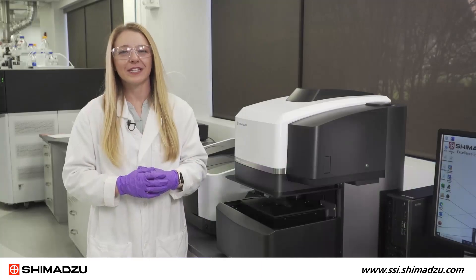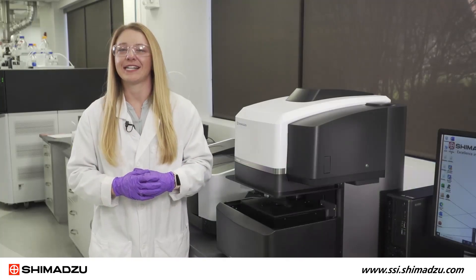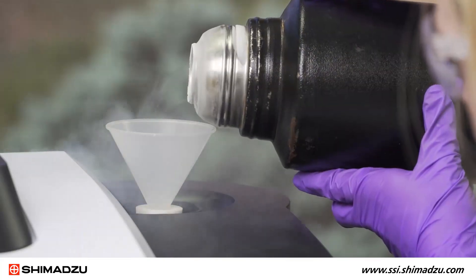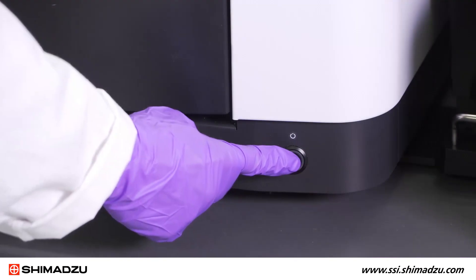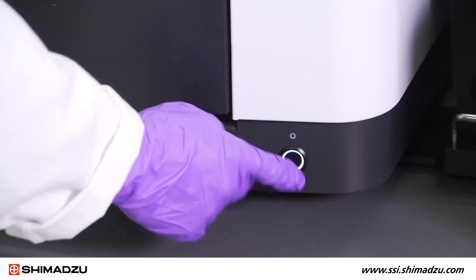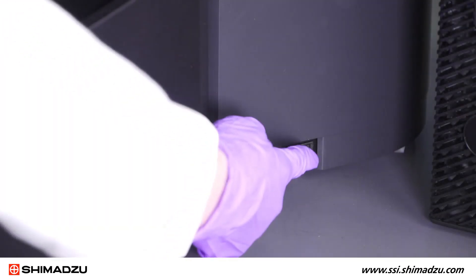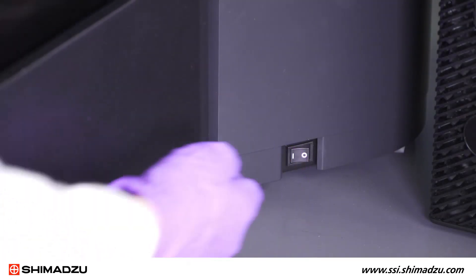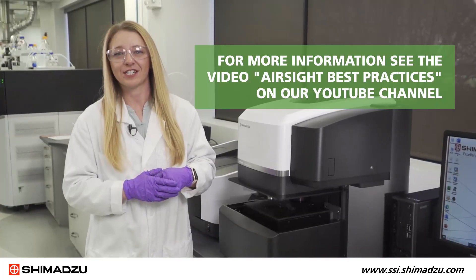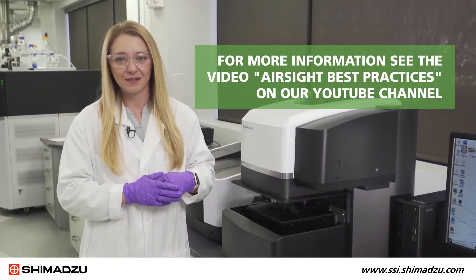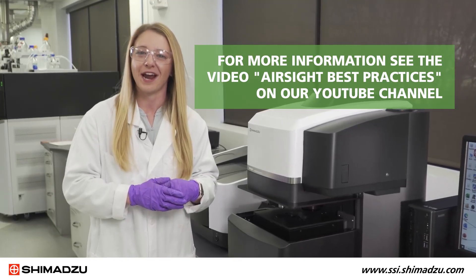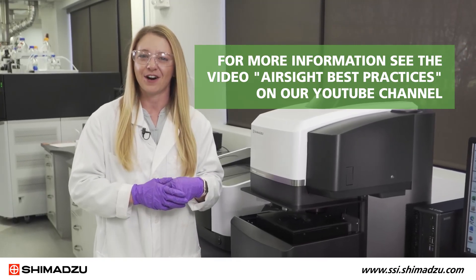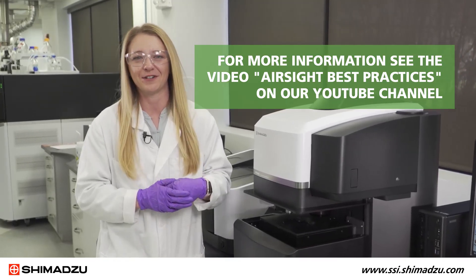Before we dive into the microplastic analysis, I first need to cool the microscope detector with liquid nitrogen, power on the FTIR bench, and power on the AIRsight. For more information on this process, please see my previous AIRsight best practice video on our YouTube channel.